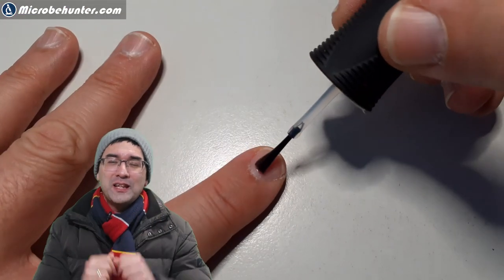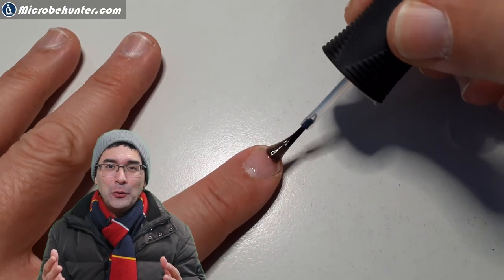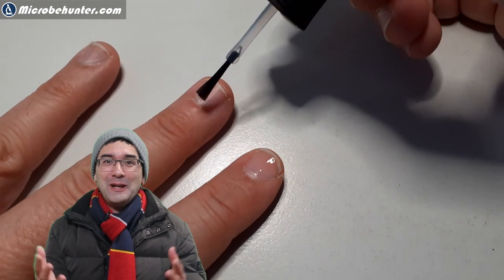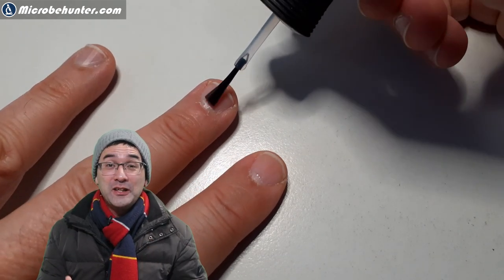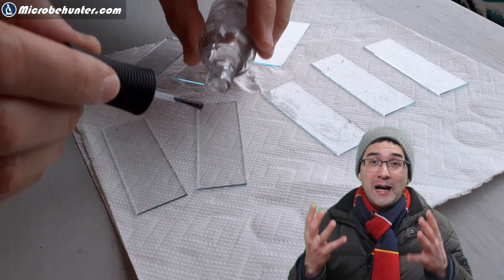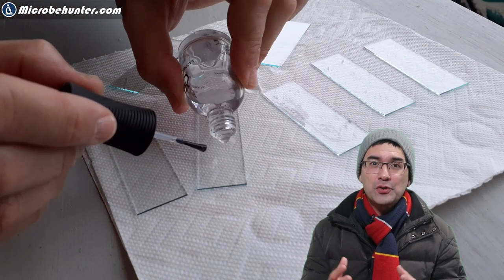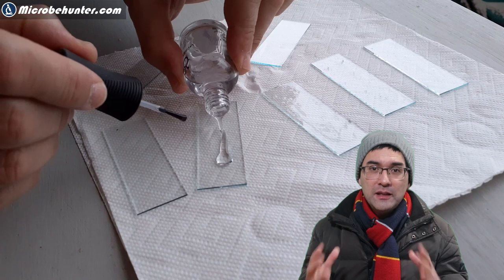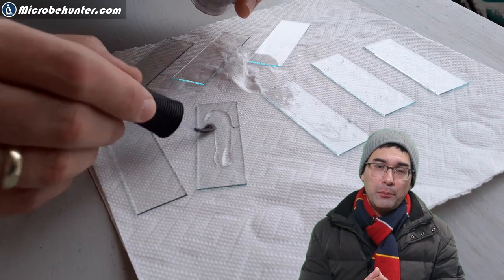The trick is nitrocellulose, also more commonly known as clear nail polish. I'm just showing you how it actually normally should be used, but I am using it today to actually cover a microscope slide, a glass slide with a thin layer of nail polish.